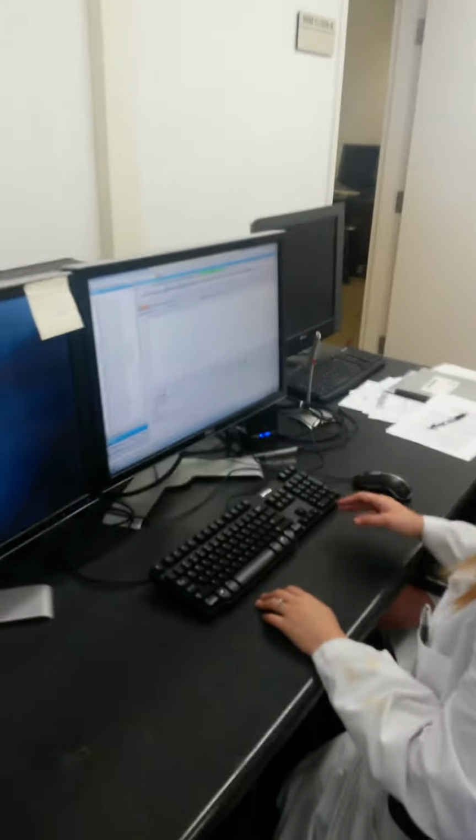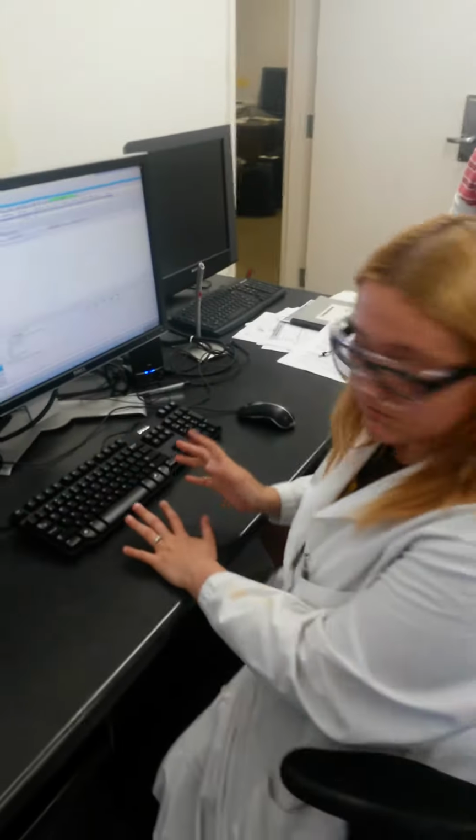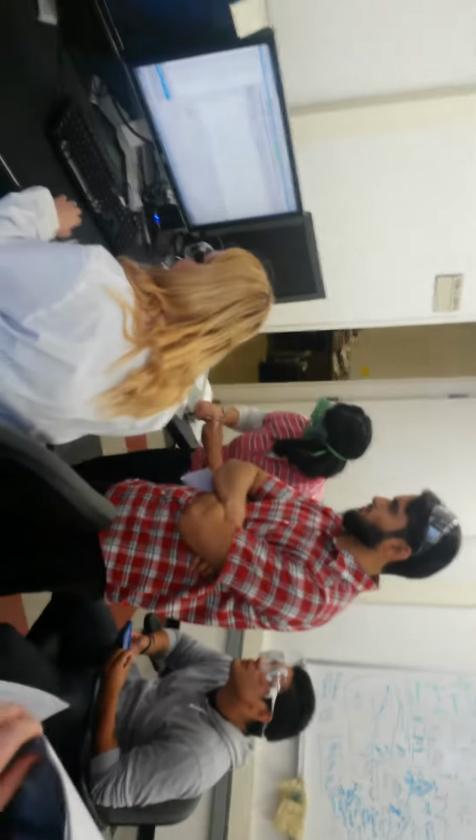So you guys have already done HPLC, correct? Yes. So you all know what an HPLC graph looks like. Caffeine elutes out at 4 point something. 4.7. This one is at 4.6, but generally it's 4 point something. Beautiful HPLC graph. This is a very typical MS graph. Looks like horridness. You would think that or that would be caffeine.